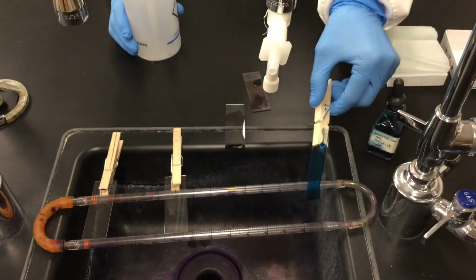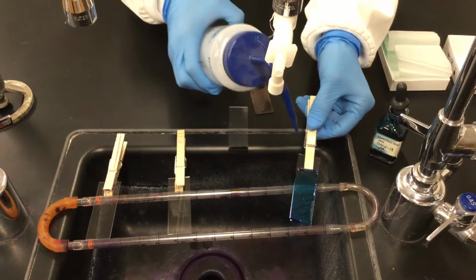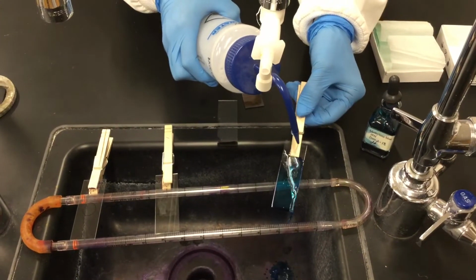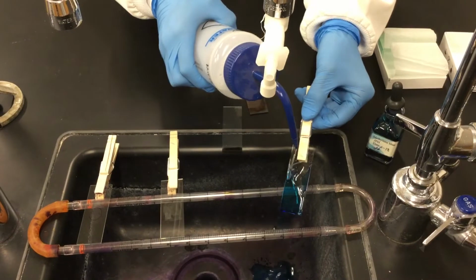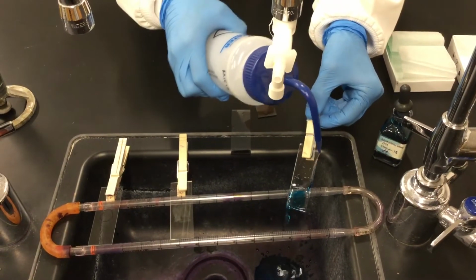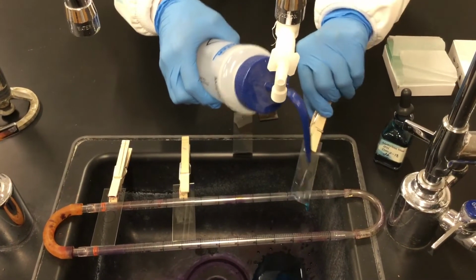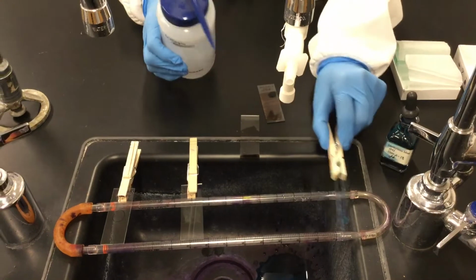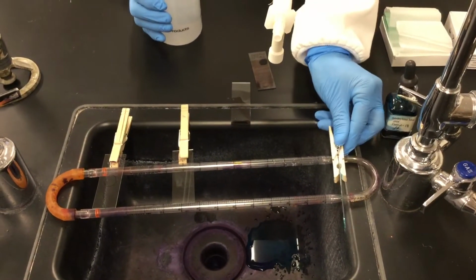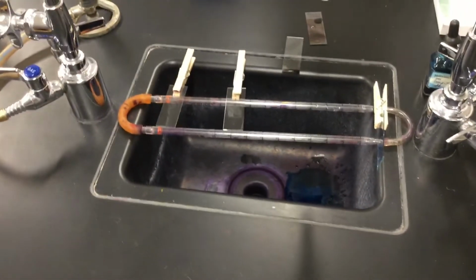Okay, so after that minute, you just check off the excess of dye, and then gently you squirt water into the surface of the slide. And then you can put it like this, and then it will rinse and dry.